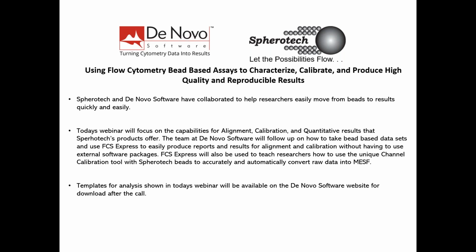The team at Novo Software are then going to follow up, and we're going to look at some of this real bead data in FCS Express and show you how to produce some reports for reporting alignments, reporting linearity, reporting calibration, all of which are going to be done directly in FCS Express without having to use external software like Excel or Prism or macros and things like that. And we're also going to come back at the end and talk about how to use the channel calibration tool in FCS Express to automatically convert raw data values into MESF values.